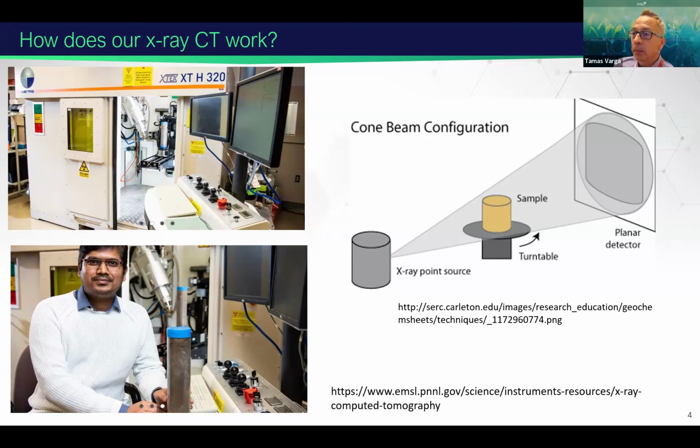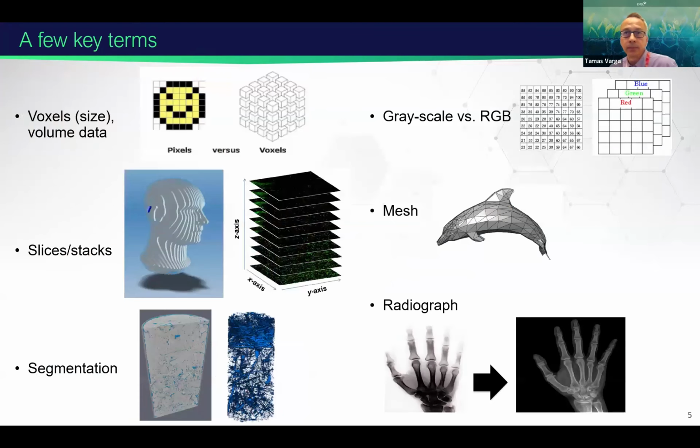Because of the electron density, the detector and the geometry of the measurement enable the computer to know that each voxel, which I will define later, has the XYZ coordinate of that location and the related X-ray absorption intensity. That's how you can relate back to the 3D image and know where that component is in the data.